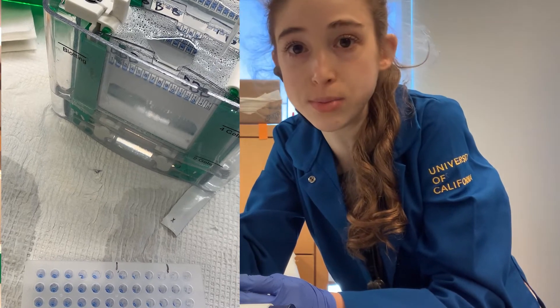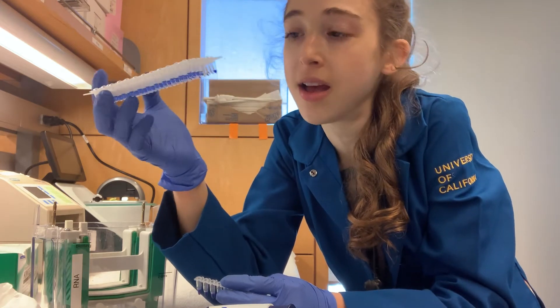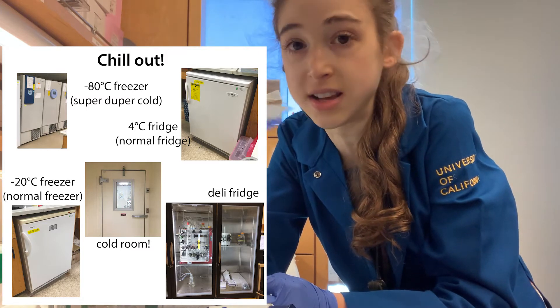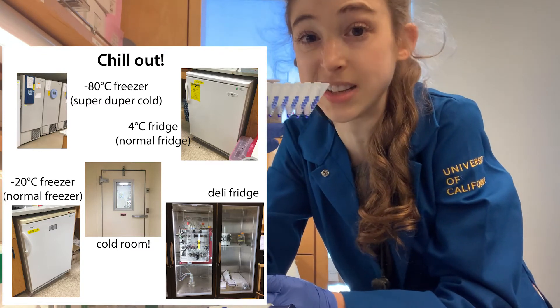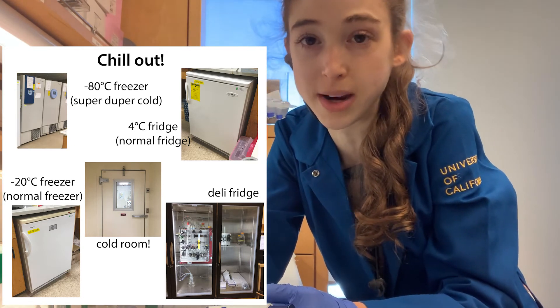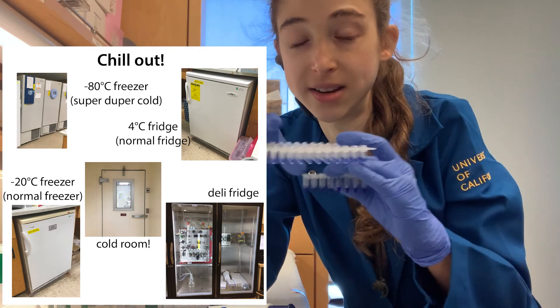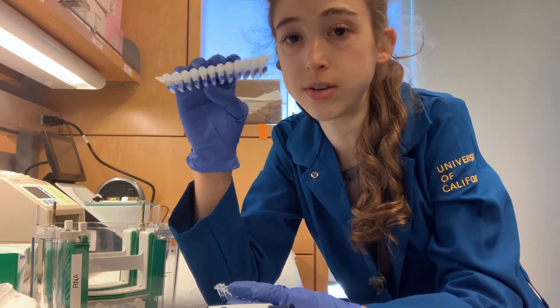Another thing is you can prepare samples ahead of time. If it took you a really long time to collect all the samples you want to run on your gel, you might be too exhausted or not have time to actually run it. So you can store samples that you've already prepared — with the SDS buffer and everything — in the minus 20 freezer. You don't want to just leave your sample fresh for days because it can start degrading. Store the prepared samples in the minus 20, keep your original sample aliquot in the minus 80, and when you're ready to run, everything is good to go.